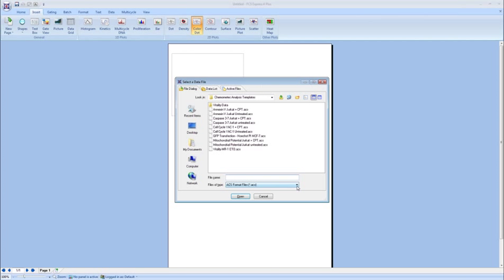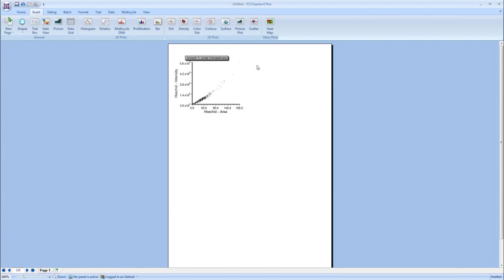You can notice here in our drop-down that one of our file formats is ACS, and again, that's the Chemometec output format that we can read directly into FCS Express. And let's just choose this NucleoCounter Annexin-5 Jurkat untreated sample. We'll click OK. We'll click Open. And what's going on now is that FCS Express is opening that file. We've inserted a two-dimensional plot for that file.